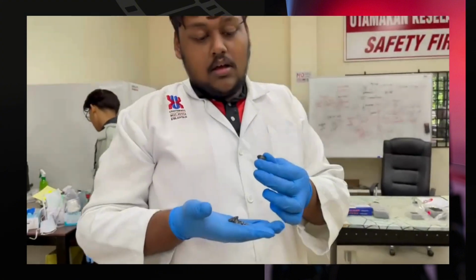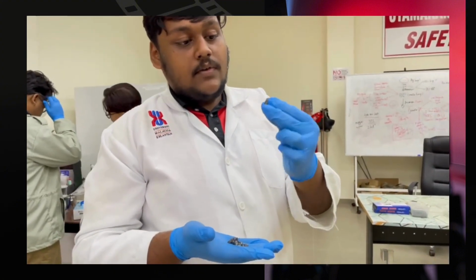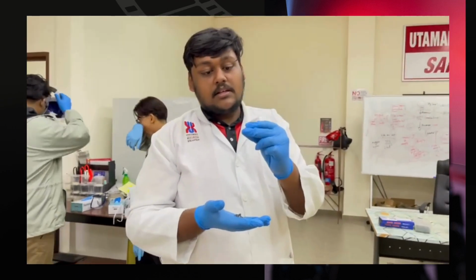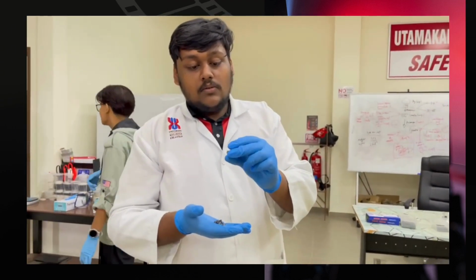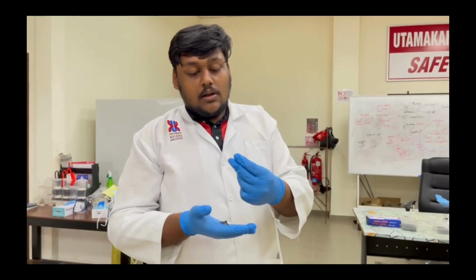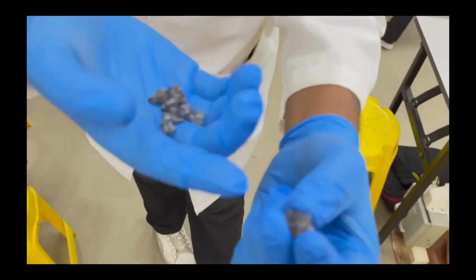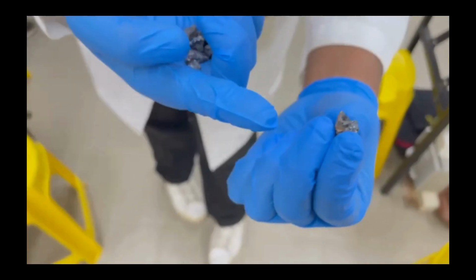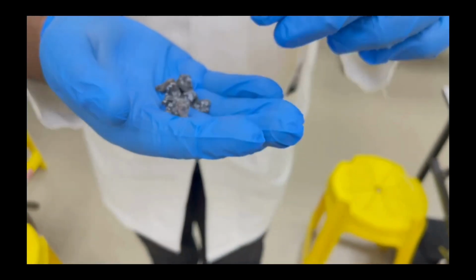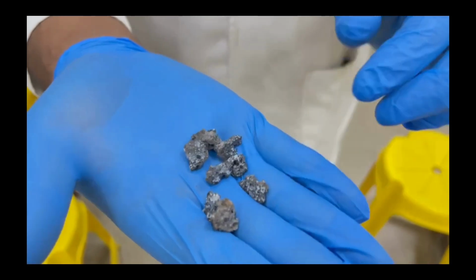So, guys, ini slag. So kita akan buat inspection first. Dari segi dia punya tekstur adalah kasar-kasar lah. And then lepas tu dia ada, nampaklah ada porous semua. Dari segi luar dia macam dalam dia kelabu, and then luar-luar dia macam warna hitam sikit lah. So itulah untuk dari segi visual inspection untuk slag ni.